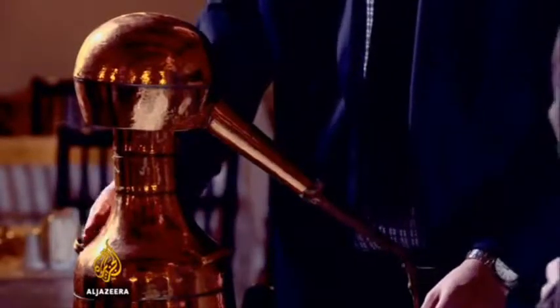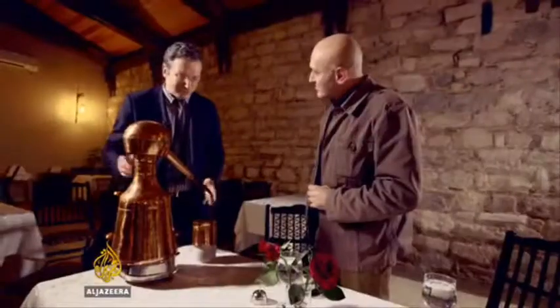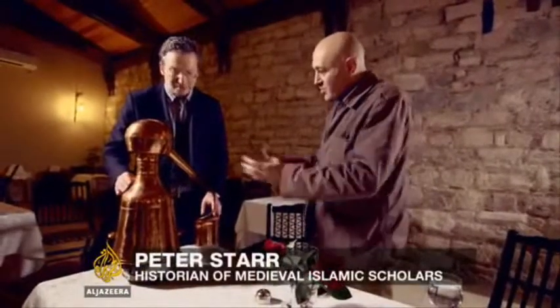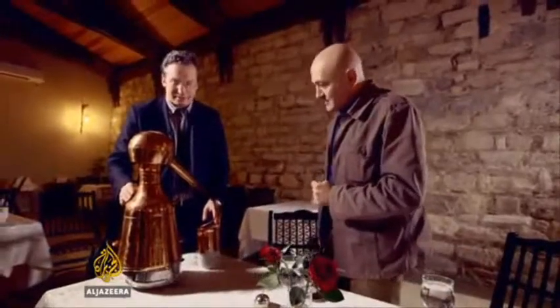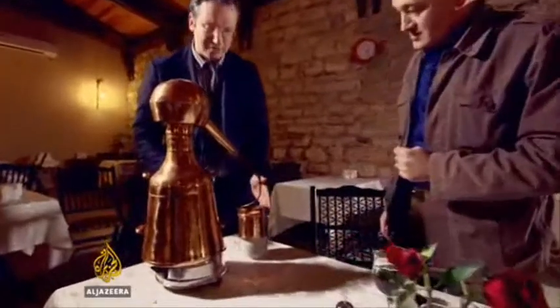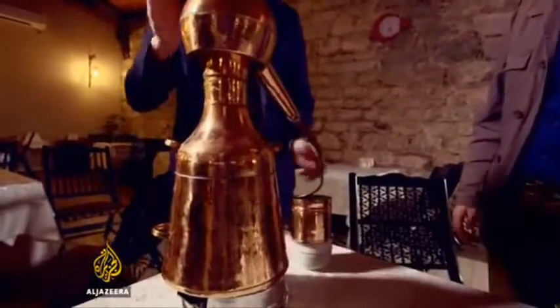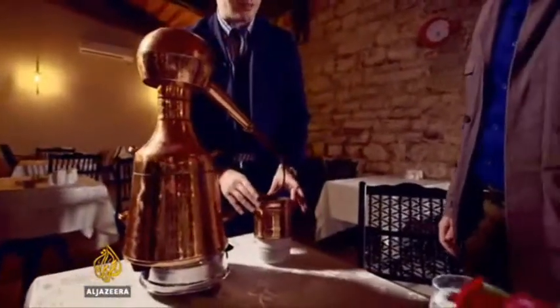To show how early chemists used it for distillation. This one is made of copper, though there were others made of glass as well. The important thing about a still is that there's a hot end and a cold end. The hot end is where the steam is produced. It then condenses and is received into the receiver here.